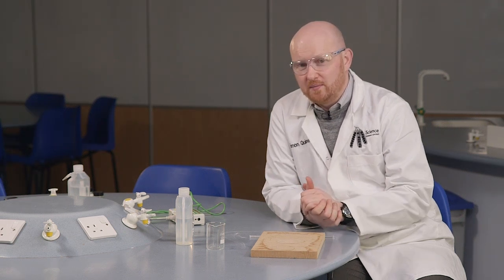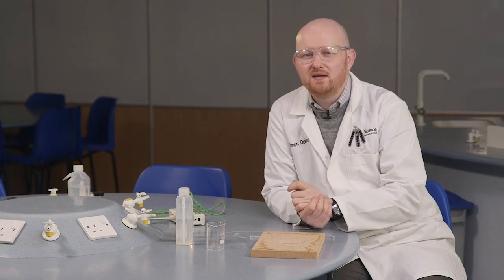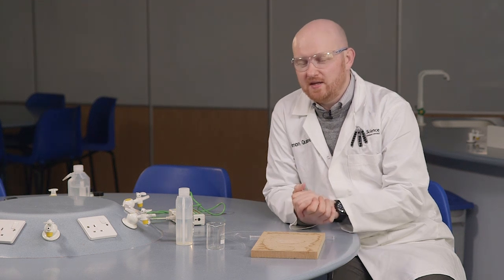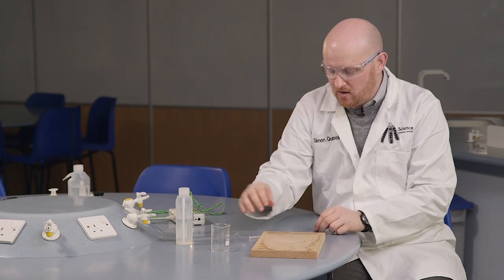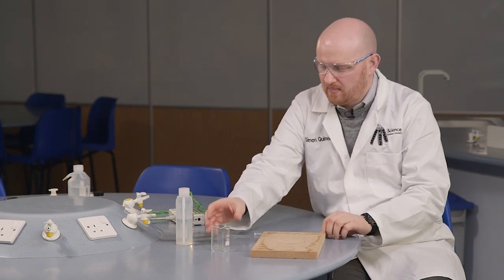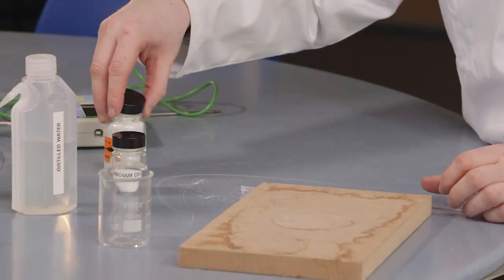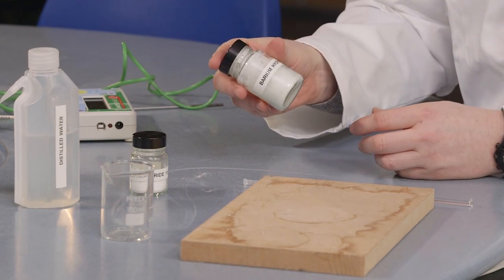Now, the first demonstration we're going to do is the endothermic reaction. Now again, this demonstration can be done completely separately and throughout the year, but we're going to use it to start setting the scene for Santa Claus is coming to town. So, for this demonstration, we have a wooden block, a glass rod, a small beaker, some water, and our chemicals. We have ammonium chloride, 11 grams, and barium hydroxide, 32 grams.